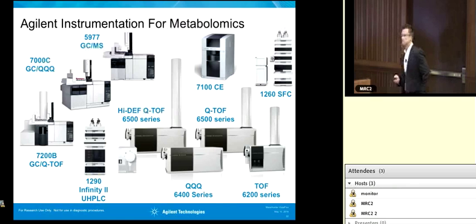So first thing we're going to do, just like we talked about, is start wide and narrow down, and hope we get a refinement. That's the big thing, right? If we narrow everything down and it still looks like this, we're going to have a problem. Whenever we do that, we actually do get a refinement. Our spectra looks somewhat more simple now, and we can start to make some sense of it, or the algorithm can. We don't see any of this part. And if you look at peak 1 now, this is just an unlabeled isotope cluster.